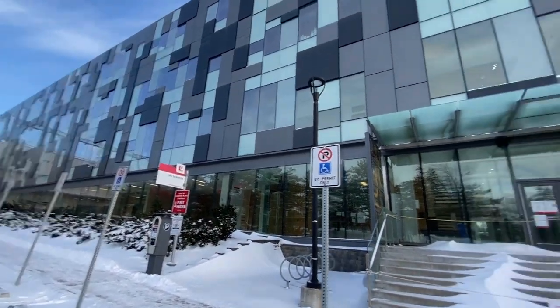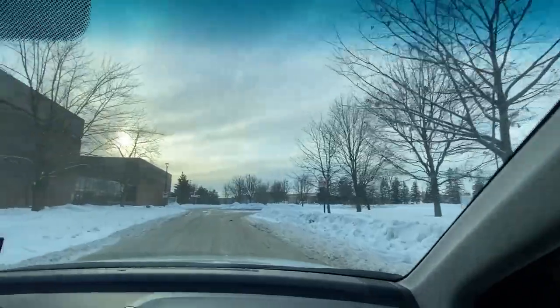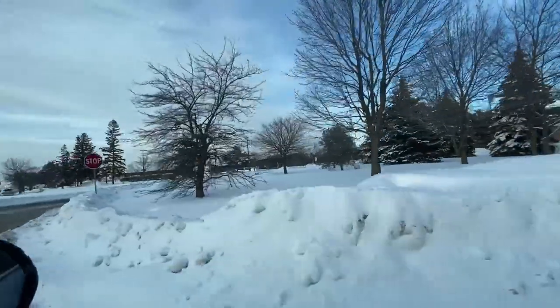This is the life sciences building — this is where my lab is, this is the campus. It looks so different in the winter. Today was the first day where my experiment went successfully. Before I wasn't seeing the bands on the gel. There's a protein that we haven't studied before that I'm preparing, and there's also a protein we have been working on before, but it's showing a better result on the gel. So I'm hopeful.